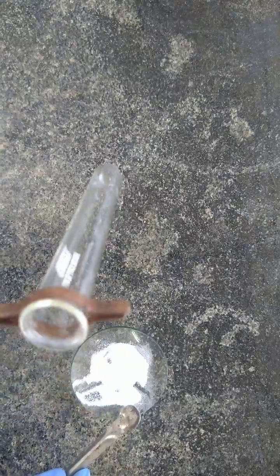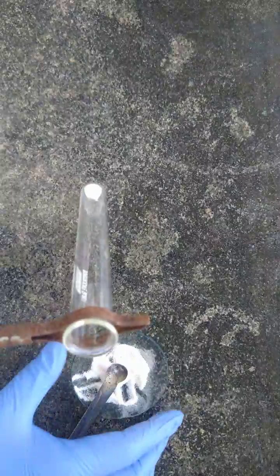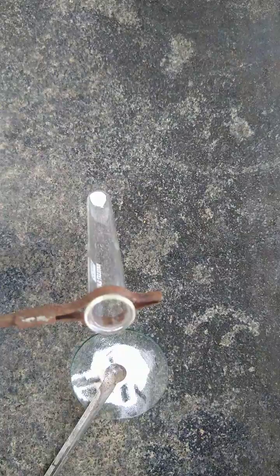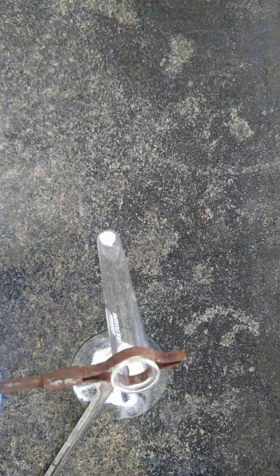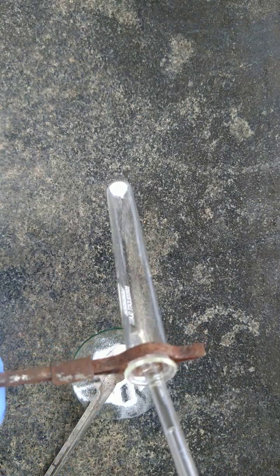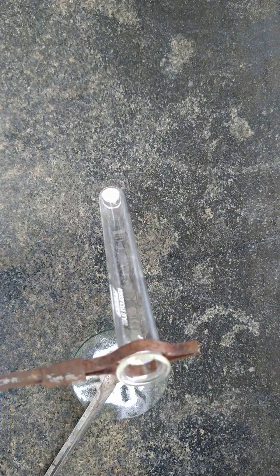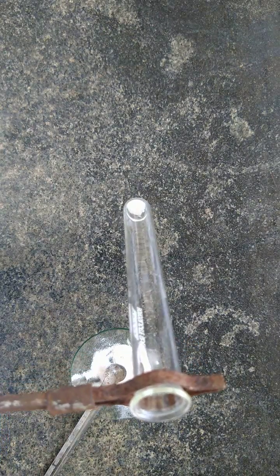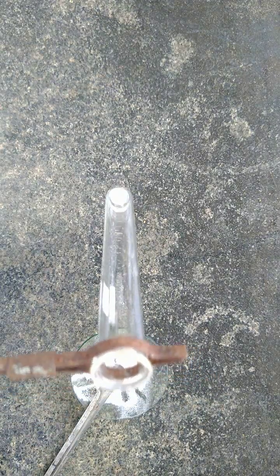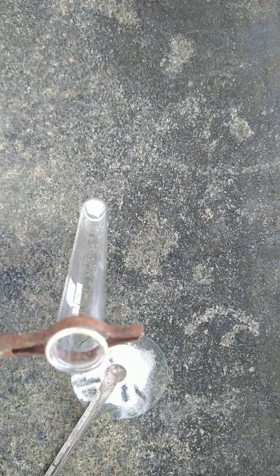What we are going to do is, in a test tube again we take a small quantity of salt, and to this we add concentrated sulfuric acid. Make sure you hold the test tube with the help of a test tube holder. To this I am going to add the concentrated sulfuric acid. So look at the observation. Yes, after adding concentrated sulfuric acid, we are getting no action between the given salt and the concentrated sulfuric acid.